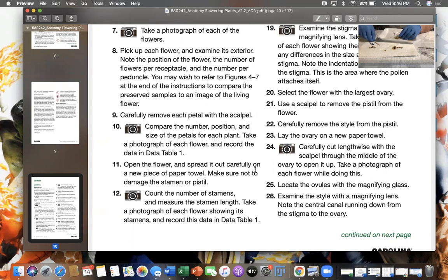Okay. This one has all sorts of ones. But it's really cool because now that we've cut a little bit away, we can start to see the base, right?